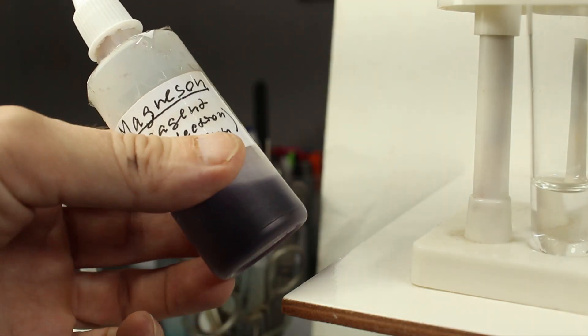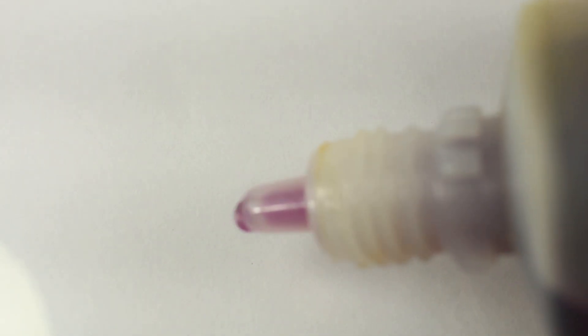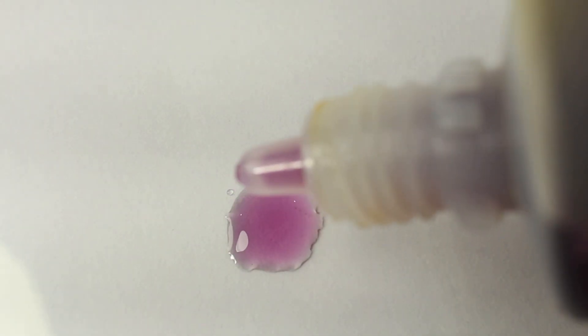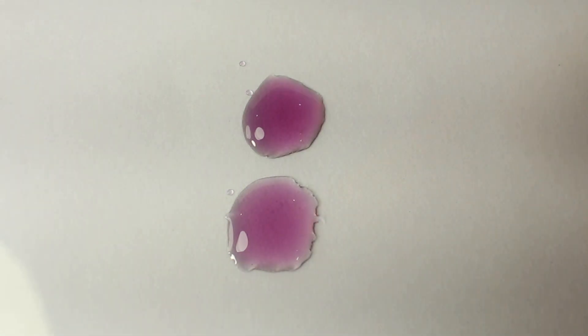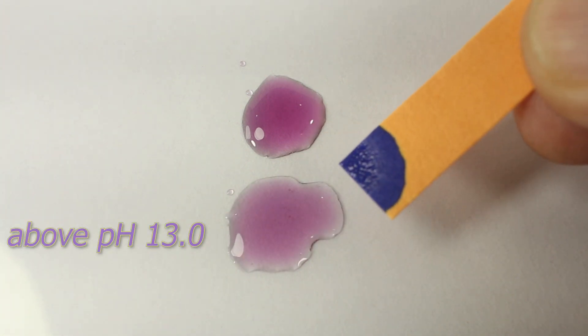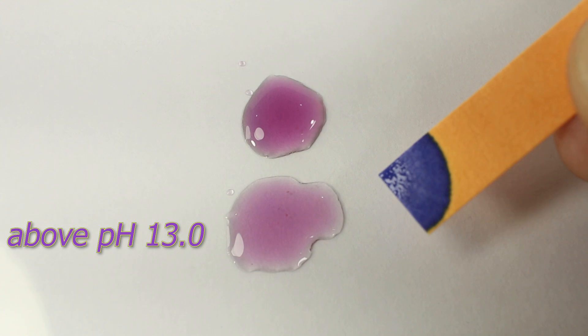It lives true to its name, it's really violet. And it's normally sold in a condition when it's very alkaline, pH is above 13. I can check the pH with pH paper, you see it's really 14 or so.